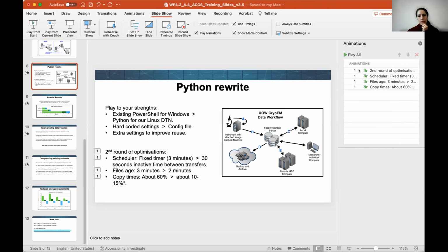Thank you. There is a question from Roland in chat. He's curious about how you handled cryoSPARC and how far away the data is from the instruments and what the delay time was. In terms of physical distance, they're all in the one building, so we're talking tens of meters, maybe 100 meters at most.